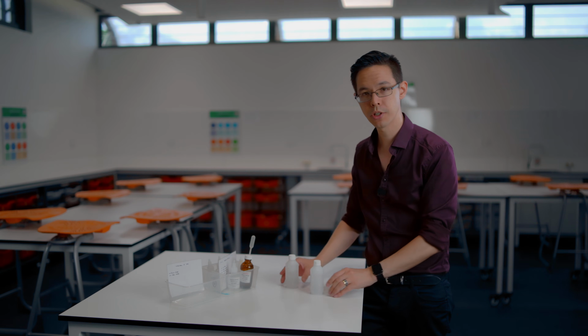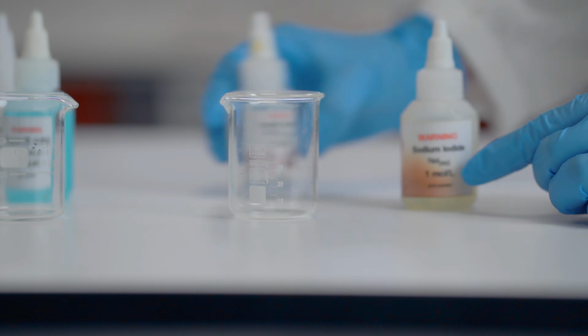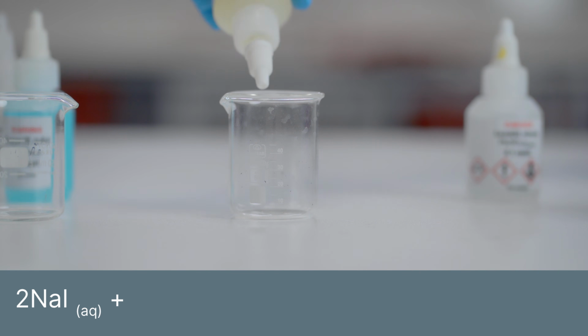So I've got a few combinations here. I've tried to find some of the most pretty and the most beautiful, colourful ones I can, and I hope you get to enjoy. Let's take a close-up. Okay, for our first reaction here, I'm going to have sodium iodide mixed with lead nitrate. So let's put in the sodium iodide. It tends to have a bit of a yellow tinge from the iodide compound.